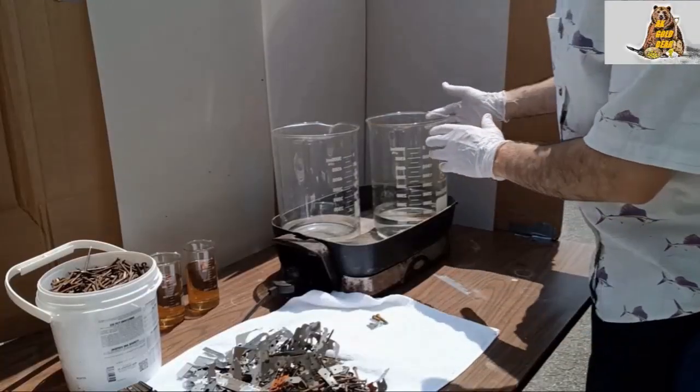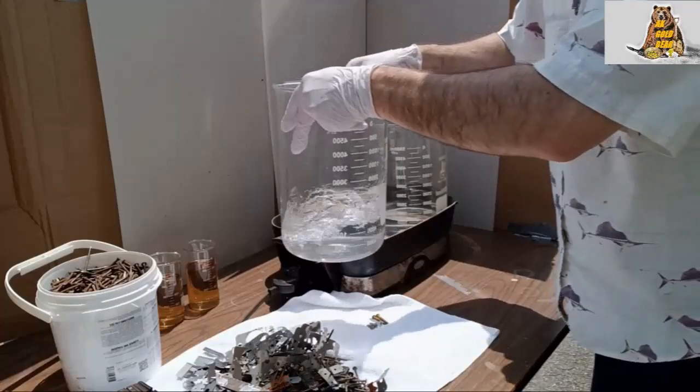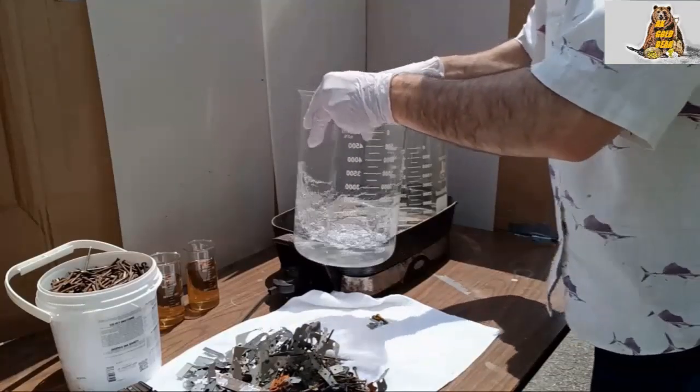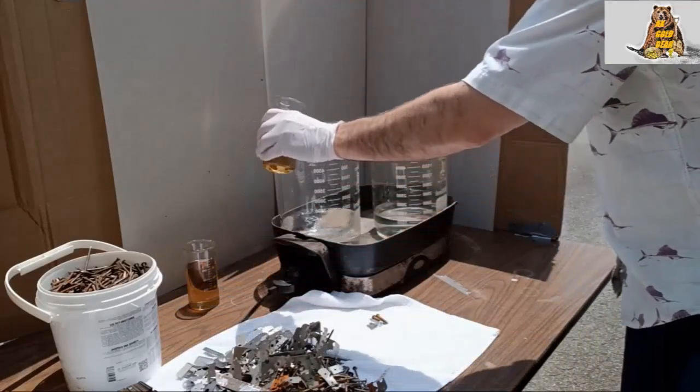To make electrolyte battery acid, I will mix water with electrolyte. Oh, I'm sorry, this is sulfuric acid. Please be careful, very strong acid.